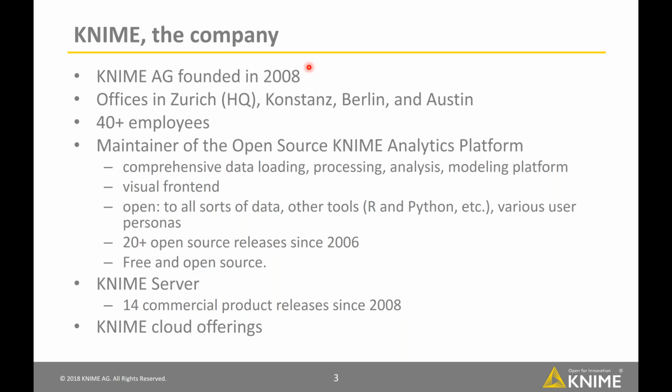So that means since 2006, which is when we first released it, there have been more than 20 open source releases, and everything on the open source side, everything with the analytics platform is free, freely downloadable, free to use. So everything I show you today is something that you can download and use yourself. There's no commercial software being used. Having said all that, we also have some commercial tools. And I'll say a brief word about that later, because it is important that the licensing revenue from selling that commercial software allows us to continue to support the open source piece.